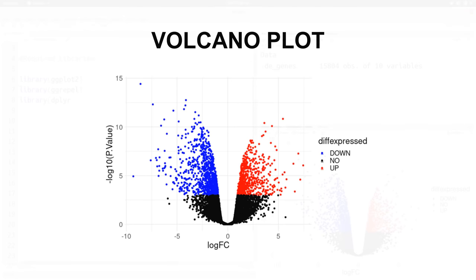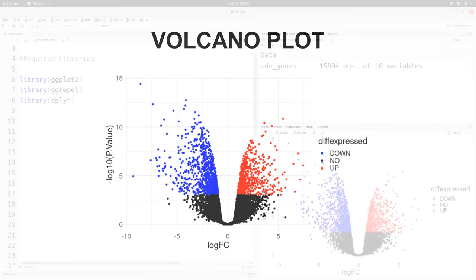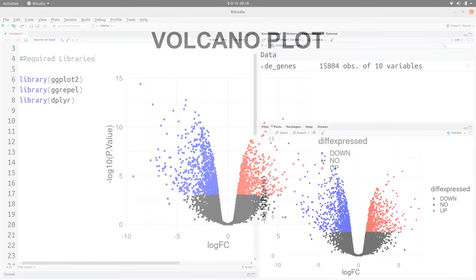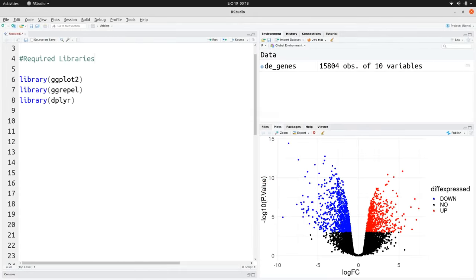For this tutorial, the only requirement is to have R installed. You should also have these R packages: ggplot2, ggrepel, and dplyr. Those are the three packages you need. We are going to use example data which is available on the Galaxy platform.